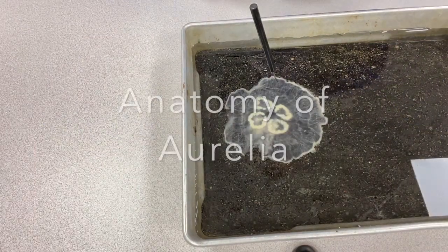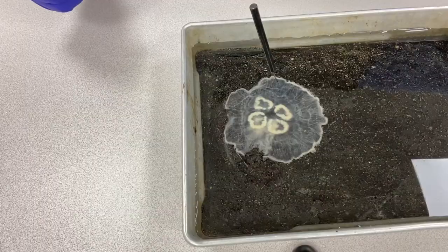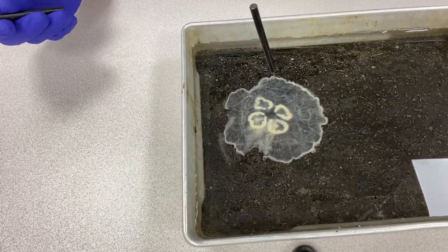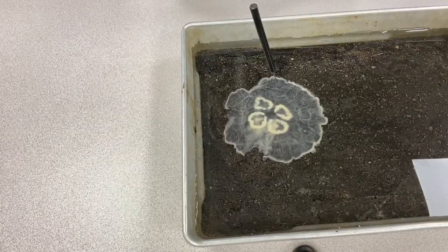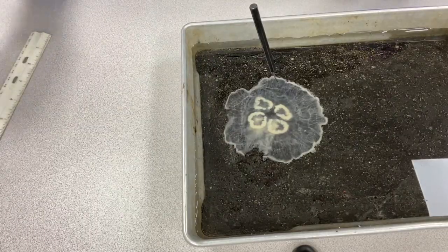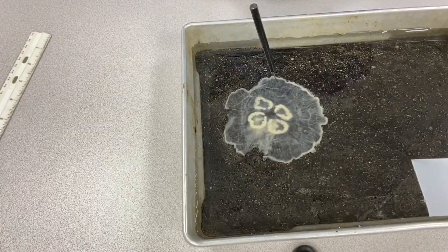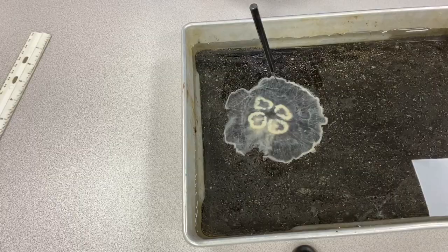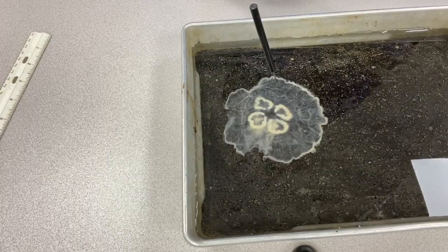In this video we're going to take a look at the scyphozoan adult medusa of the genus Aurelia. You can find a drawing and labeled structures of this animal on page 55 in the lab manual. I'm going to give you a walkthrough of some of the major parts and pieces of this animal that will help you understand what you're seeing in the lab manual.